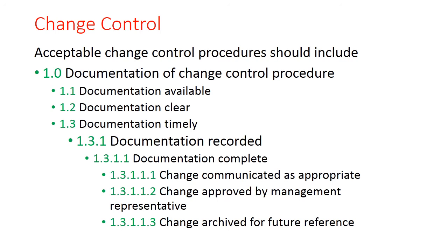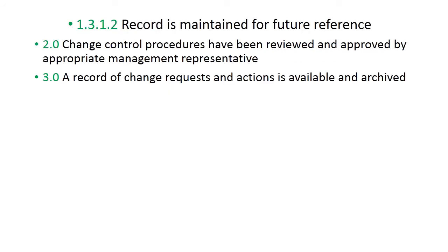Change approved by management representative. There must be an approval from the laboratory management representative before incorporating any change into standard operating procedures. Whatever changes you make should be documented properly, and documents archived and stored properly for future reference. Change control procedures have been reviewed and approved by the appropriate management representative.